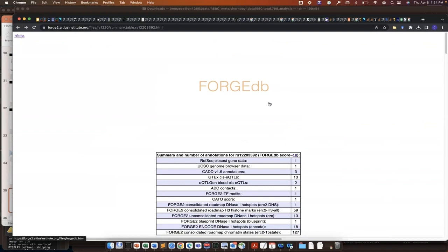Sometimes some mouse variants and human variants have similar regulatory elements. This is rare, but we would like to get an expanded encyclopedia. That's something I'm interested in. But the human version is already out there, and this is all publicly accessible online. So we definitely have the human data, which is the most important data set right now.